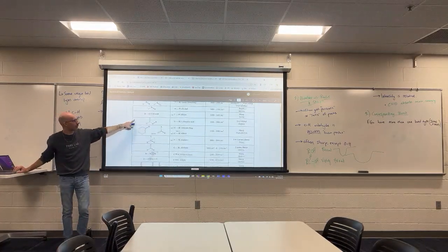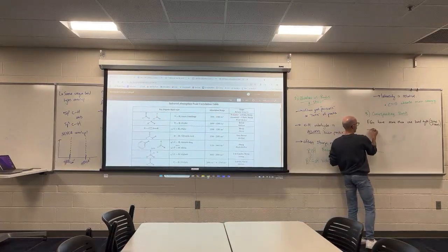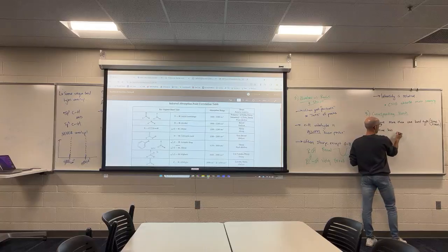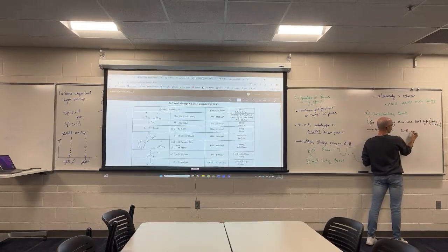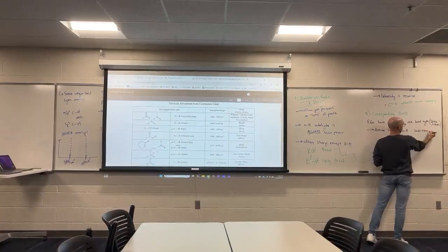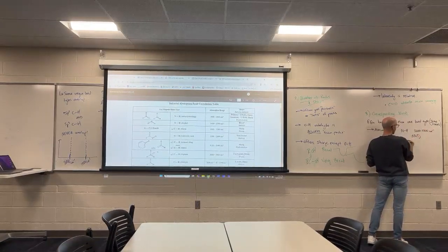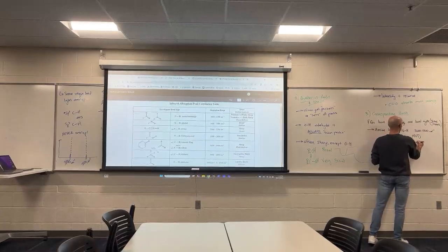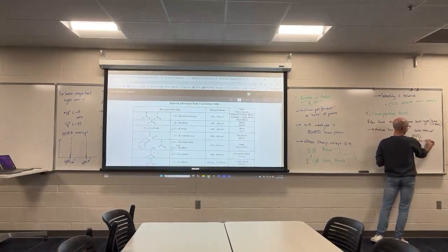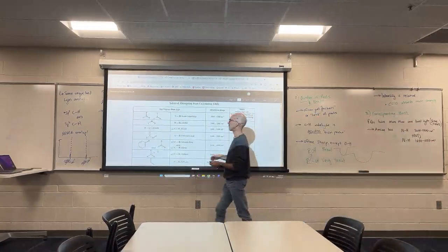I'm going to start at the top, and we're going to look at the amine. The amine has the NH stretch in that high frequency range. And it has the NH bend in a lower frequency range.